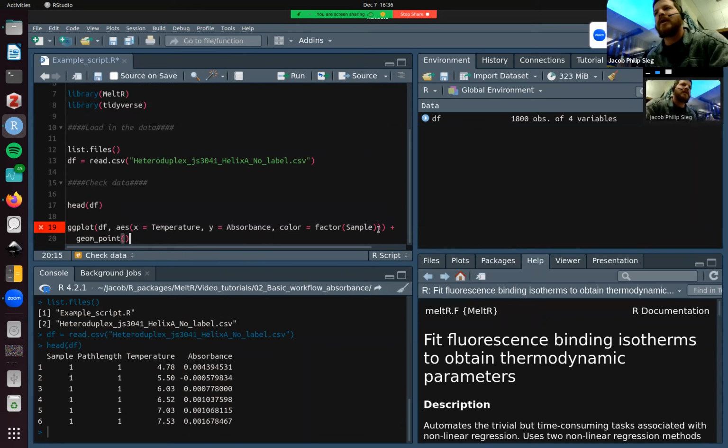Let's see, I'm getting a little error in my script. I don't know why. I think we're fine.